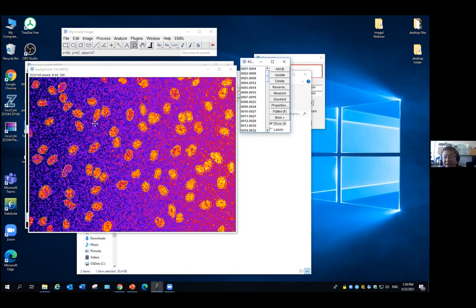Some of these problems, as we show here, we can use digital image analysis to help you combat. But some of them we cannot help. Your raw image does not have the resolution you need. We cannot increase this on the digital side. Okay? So always, when you begin to take your pictures, try to get a good picture and then analyze it. Once you analyze it, you realize what's wrong with your raw image. Is it too noisy? Are the pixels too big or too small? How can I improve that on the acquisition part to help me on the analysis part?